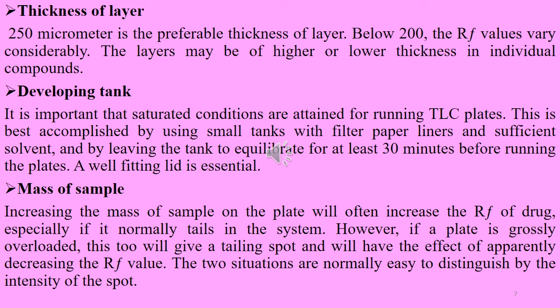Developing tank. It is important that saturated conditions should be attained for running TLC plates. This is best accomplished by using small tanks with filter paper liners and sufficient solvent, and by leaving the tank to equilibrate for at least 30 minutes before running the plates.